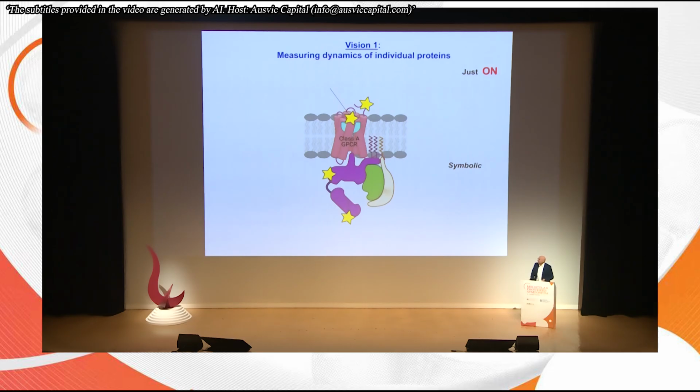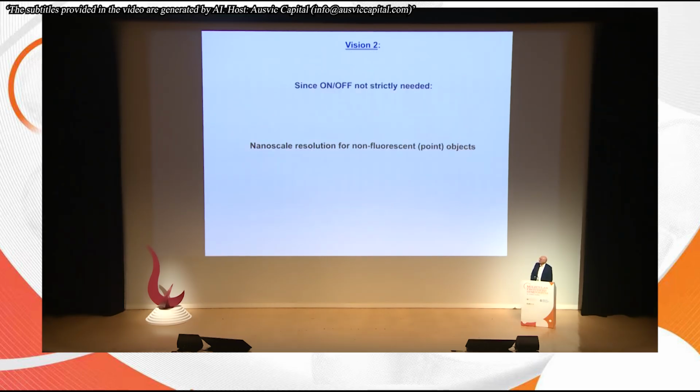So what I think is, whereas super-resolution microscopy told us where proteins are in the cell, MINFLUX has the potential to show us how they actually work mechanistically. And this is something that really excites me and also excites the people in my lab. Everyone wants to work on this and not on other things anymore. I think this is a lot of fun right now.